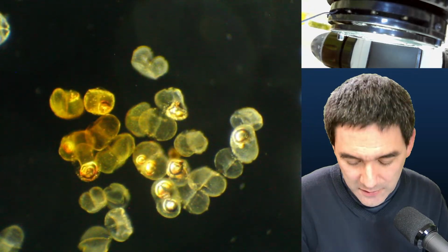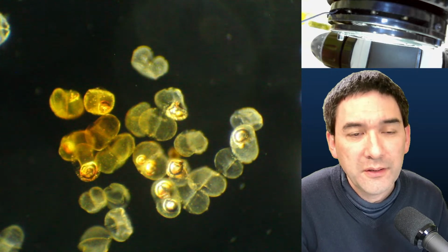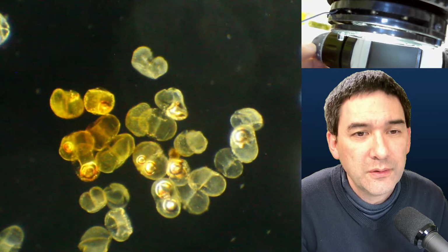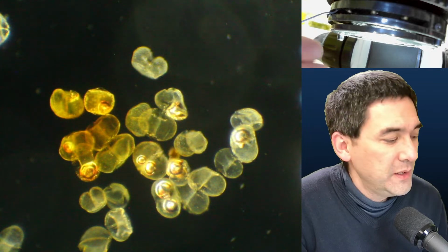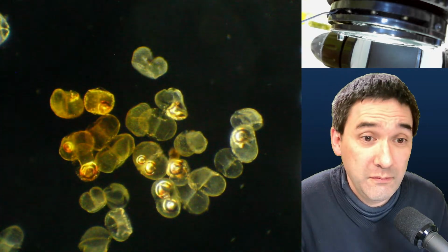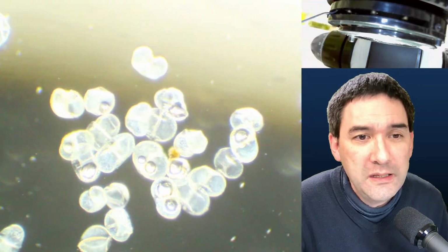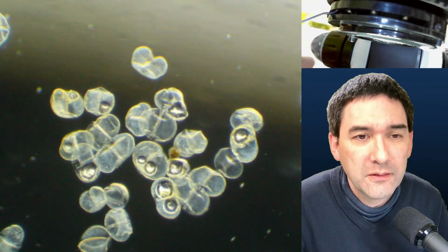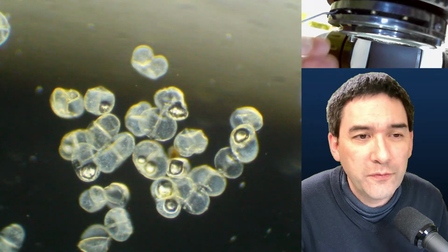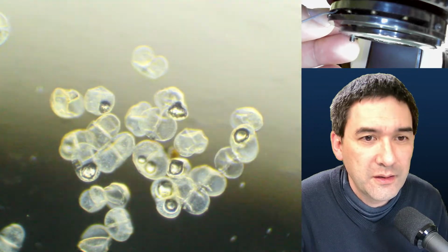Some mounting media, like Euparal, make it more transparent, and then it's not quite as reflective anymore. So if it seems to be quite transparent, then we might get a better oblique effect, but maybe not such a strong dark field effect, because it's not able to reflect the light as much.